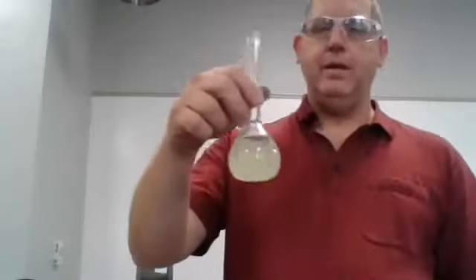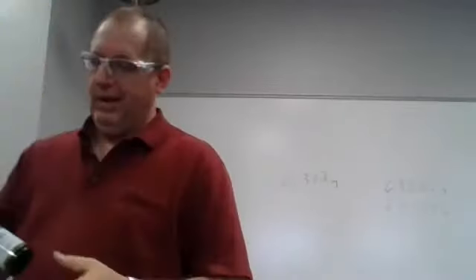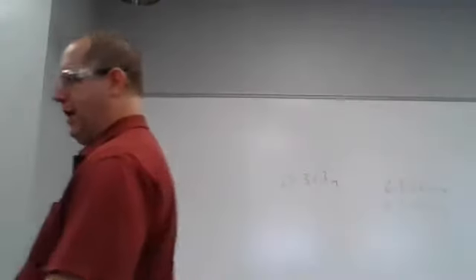In the meantime, we need to go back to our iron solution. Now, if I did this correct, I'm just going to throw out a number. Let's say, just for example, that this would have 65 milligrams of iron in 100 milliliters. How would I get that crazy number? Well, if you look at the bottle, you will see that it's a 65 milligram iron tablet. And if it's 65 milligrams in a liter, that would be 65 milligrams per liter. But it is not per liter, it's in 100 milliliters. So it's 65 milligrams in 0.1 liters, or 650 milligrams per liter.